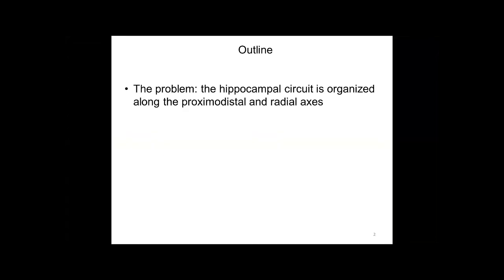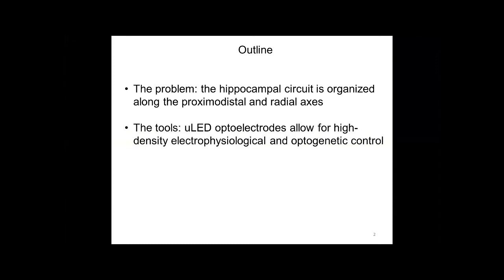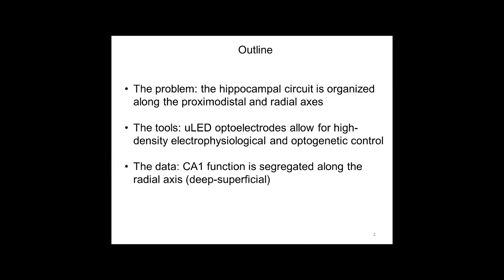Along my talk, I will start first by posing the scientific question. In particular, we are interested in understanding the organization of the hippocampal circuit in health and disease. Then we will look for the appropriate tools to address this question, and we'll see how micro-LED optoelectrodes can allow for high-density recordings and control at very precise resolution. Finally, I will show examples and discuss approaches to gain enough resolution for dissecting the hippocampal microcircuits.